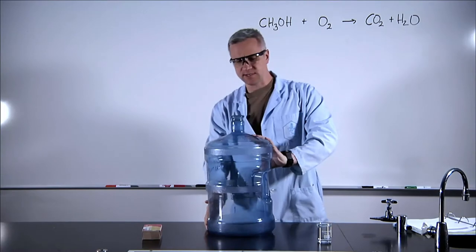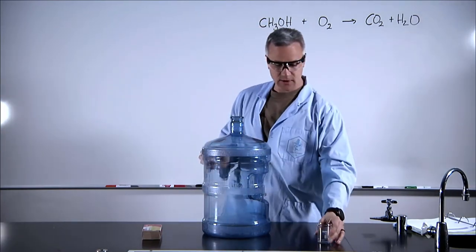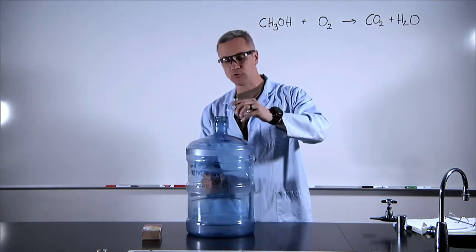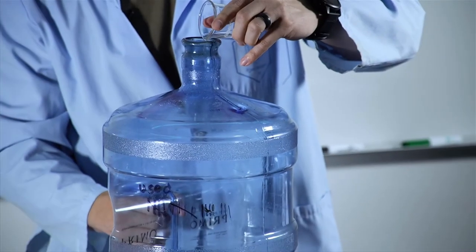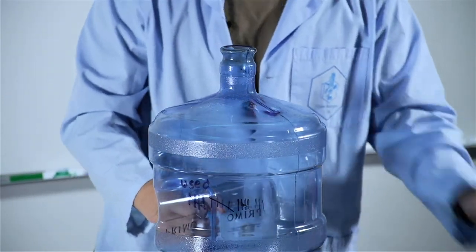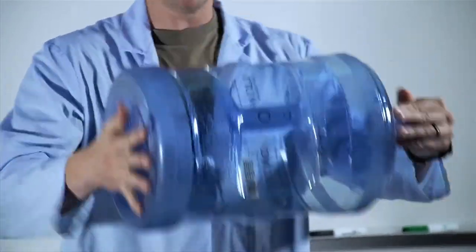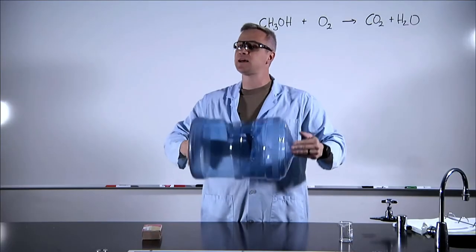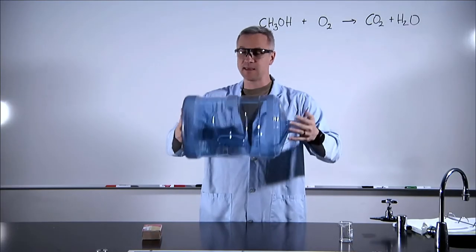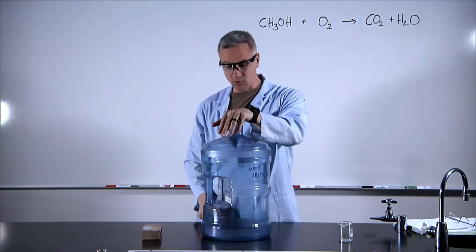And as I'm doing this, remember to think about why this happened. And so here we go with our methanol. Again, this is our fuel source. And don't forget, we need that oxidizer. And so remember I said last time, I mixed it up, wanted to vaporize that methanol as much as possible so it could get next to those oxygen molecules. And so we can have a more spectacular reaction.